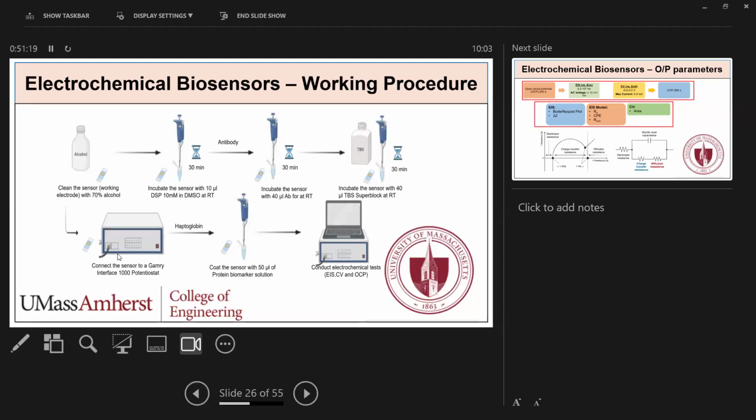And then, in a series of steps, we add this particular protein. We selected certain proteins. In this, I'm just going to give you an example of a protein which is responsible for breast cancer. We added that particular protein at different concentrations, because we wanted to check the concentration-dependent electrochemical sensor, right?